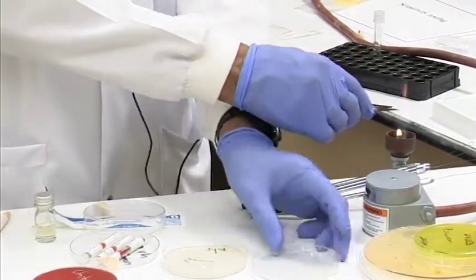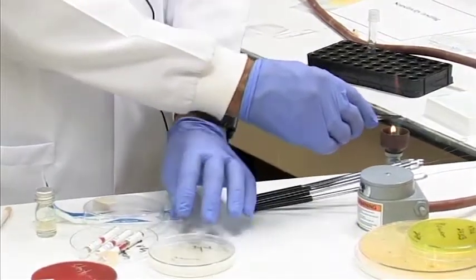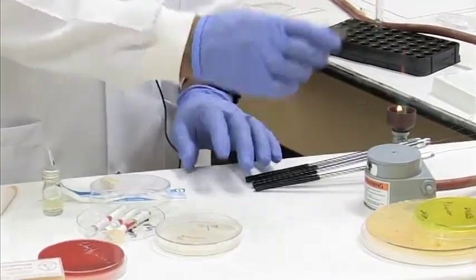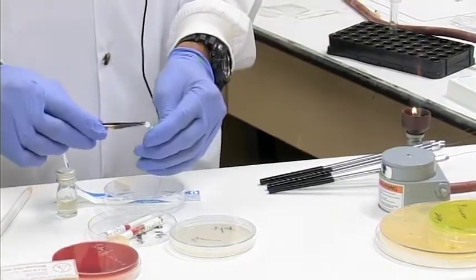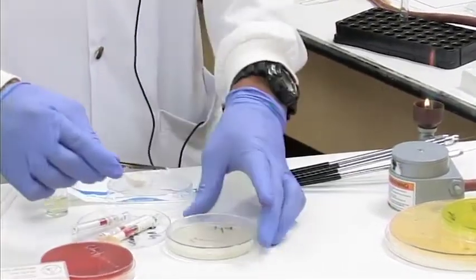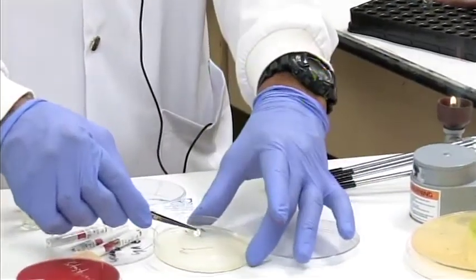Flame and cool again. You might want to keep your plate covered during this procedure. Once it's flame and cooled again, or use a different forceps that has been flame and cooled, choose a different antibiotic, remove it, and apply it onto your agar plate.